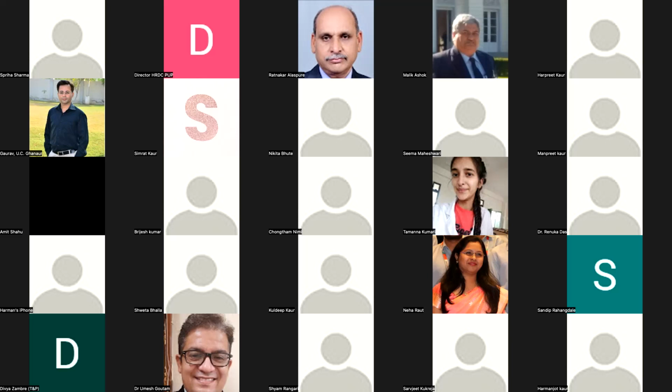Yes, sir. Bleeding sometimes comes if we don't select the proper polarity of the mobile phase. And because we are always running on hit and trial of the separation, if one peak is not coming good, we accept it, and if out of 5, 4 peaks are good, or one is a little bit bleeding or having a tailing effect, then we compromise a little bit, and it depends on the polarity. Mainly, it's a game of polarity. Yes, sir.